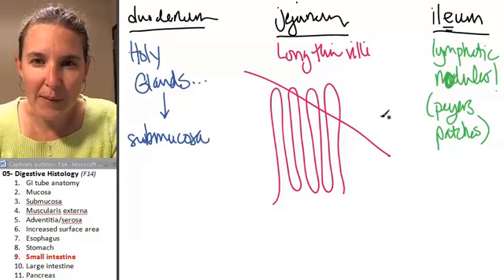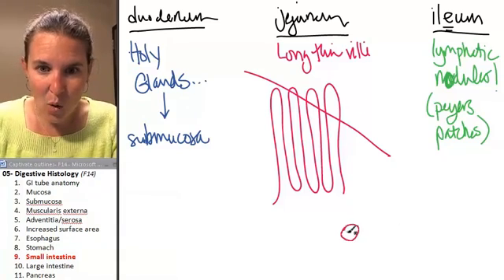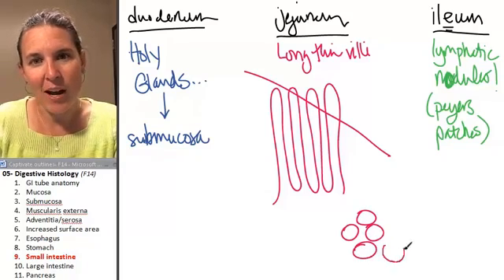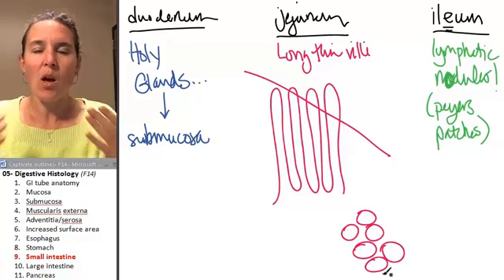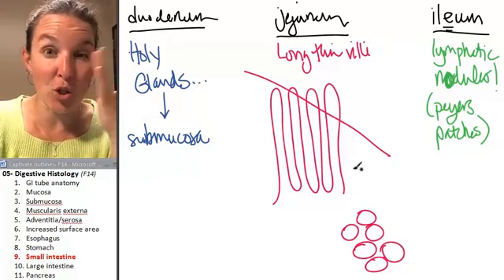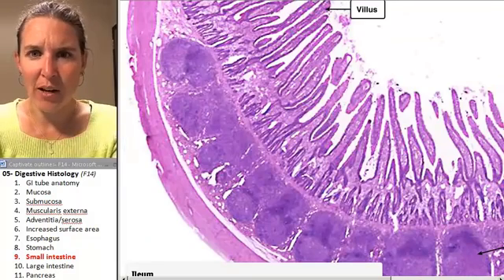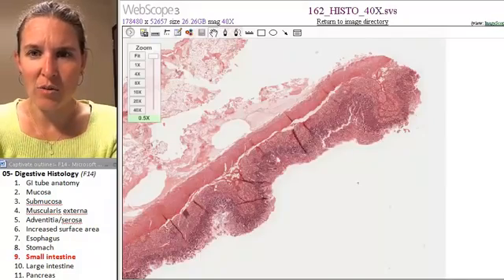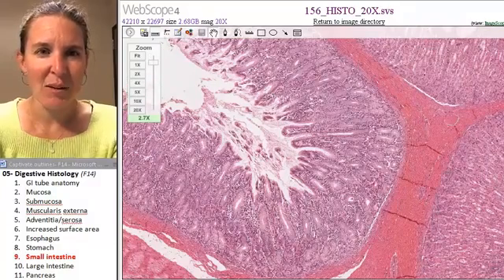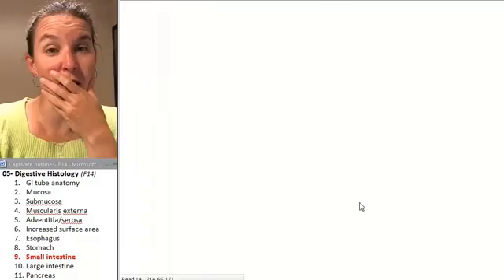Do you agree that if I had that, what I would see is a whole bunch of kind of circle-y shapes? Can't remember if I have a jejunum for you to look at. It almost looks like giraffe skin, like the shape of a giraffe. Okay, I got to go see if I have any jejunum. I don't think I got jejunum. Why didn't I? That makes me kind of want to go see if I can find some jejunum.